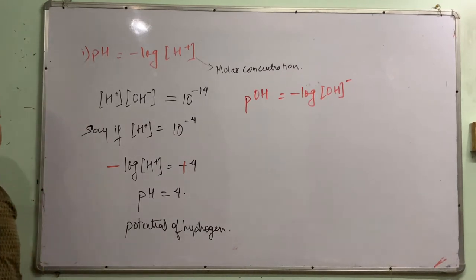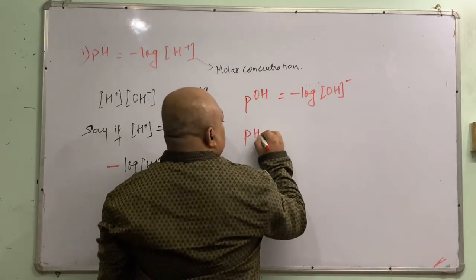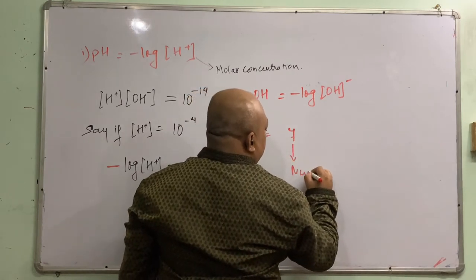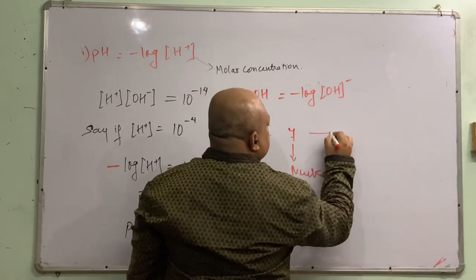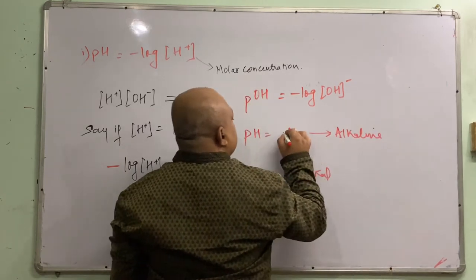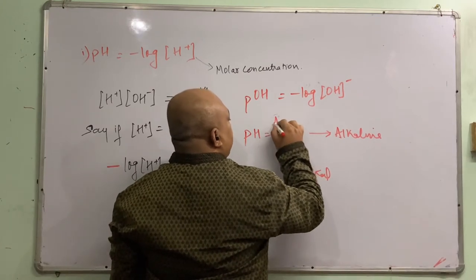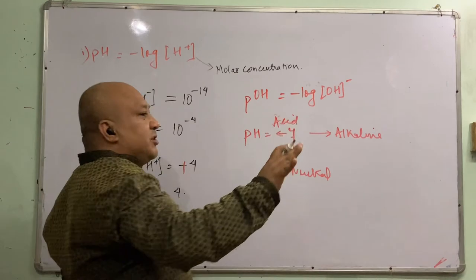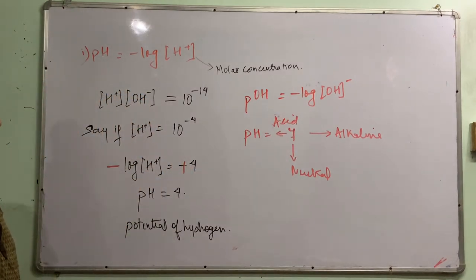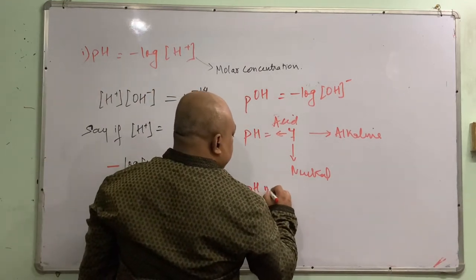I don't have to go in depth. Now let me see how pH is important. pH till 7, this is neutral. This side is alkaline. This side is basic. Sorry, acidic, okay? I don't want to go into much calculation because this is a practical, not theory. It will come in Environmental Engineering Part 1. Only this much. And pH is estimated by using a pH meter.